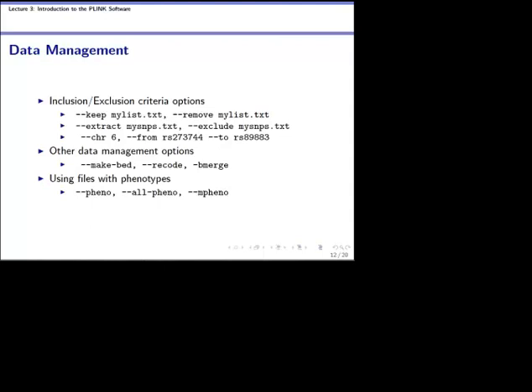It would be very difficult in R to subset the data and then run the analysis. Here, with this option, you just say keep, or do analysis on, my list of people that you're interested in. Without having to create a whole new data set with just those individuals.